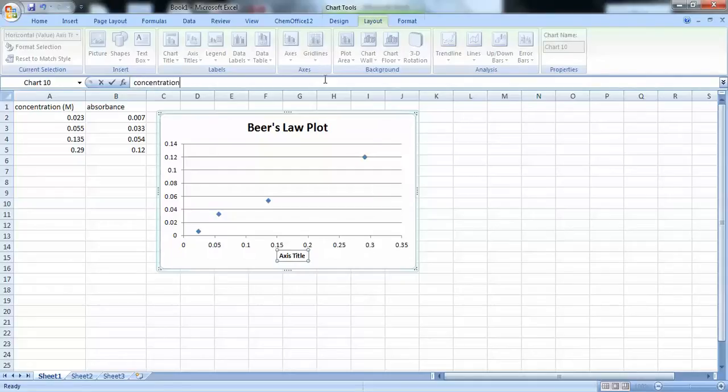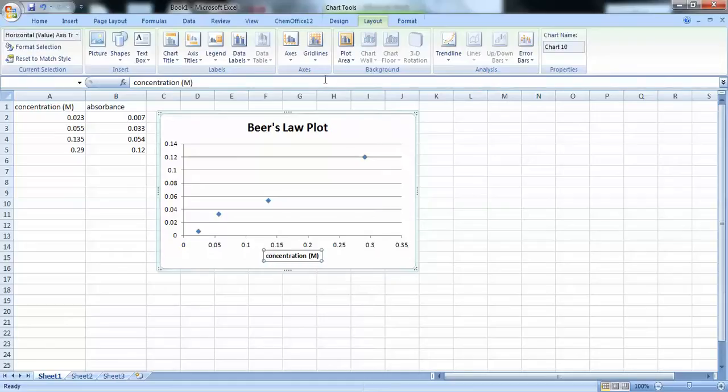So, I'm typing in concentration. And our unit is in molar.